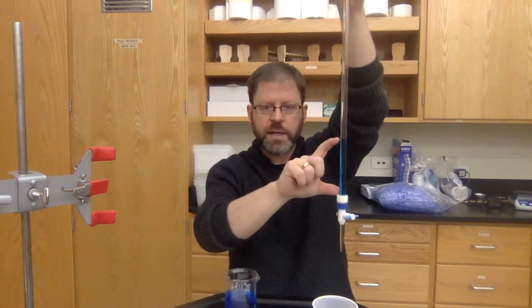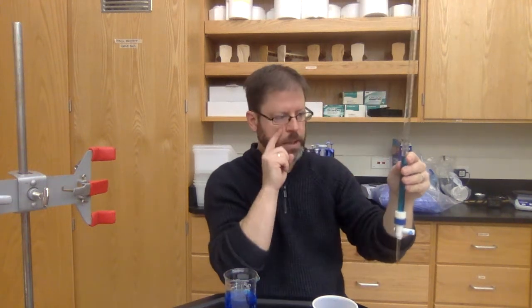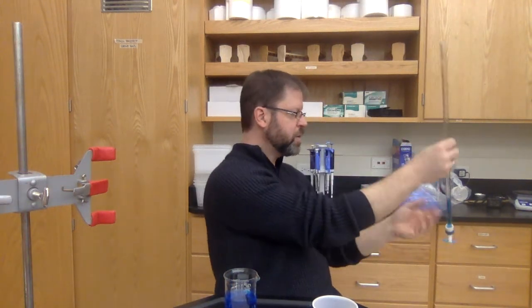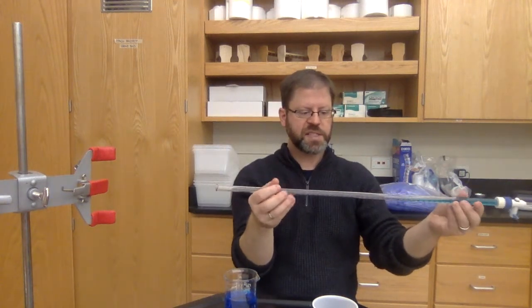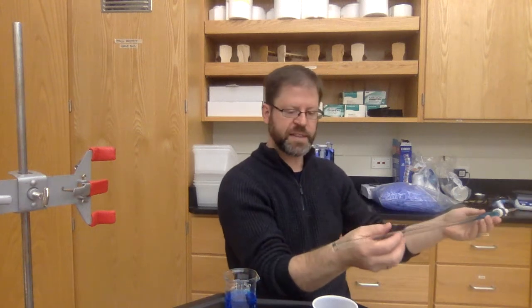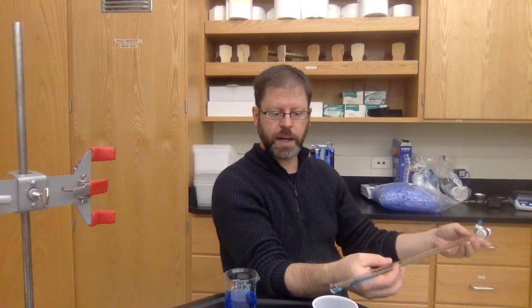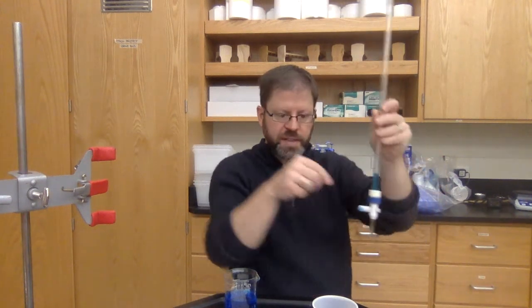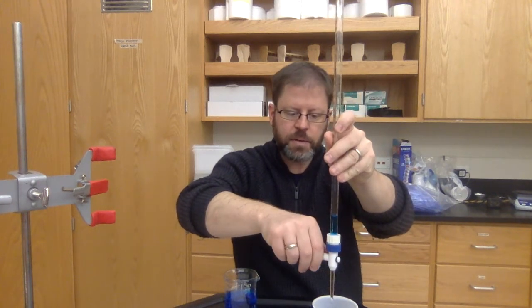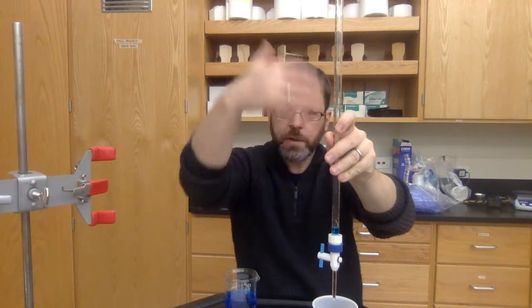So I'm just putting in a little plug. Okay, I don't need to waste, this is probably too much. I don't need to waste my titrant here. But what I can do is I can move this roughly horizontal, and I'm starting to spin it, and I'm trying to wet the sides of the burette, and I'm going into my cup here. Okay, so I've now wet all the sides of the burette with the titrant, and then I'm also going to allow some more of that solution to go through here. Okay, so I'm totally rinsing the inside.